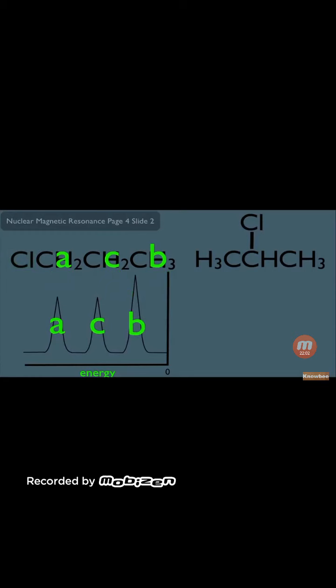Which means technically, for this molecule, you have 3 hydrogens and 3 different electronic environments. Which again means if we run this through the NMR and look at the data, we should expect to see 3 signals in the HNMR. Again, 1 signal each for bringing each one of these hydrogens, A, B, and C, into resonance. And why not? Let's label him. Remember, this guy would be our A hydrogen peak, the most de-shielded. This right here would be the B peak, the most shielded. And then remember, C right here would be in the middle of them. So that's what we would get out of the HNMR for that molecule.